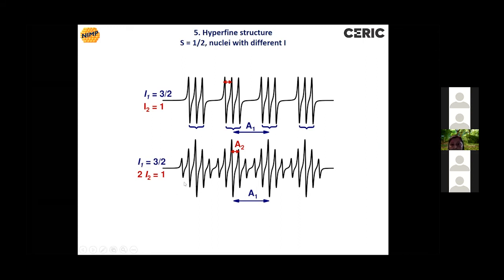So it is much more complicated, and you have to look very carefully at all the periodicities to identify which line is due to each hyperfine splitting, and to really separate the contributions from the 3 nuclei.